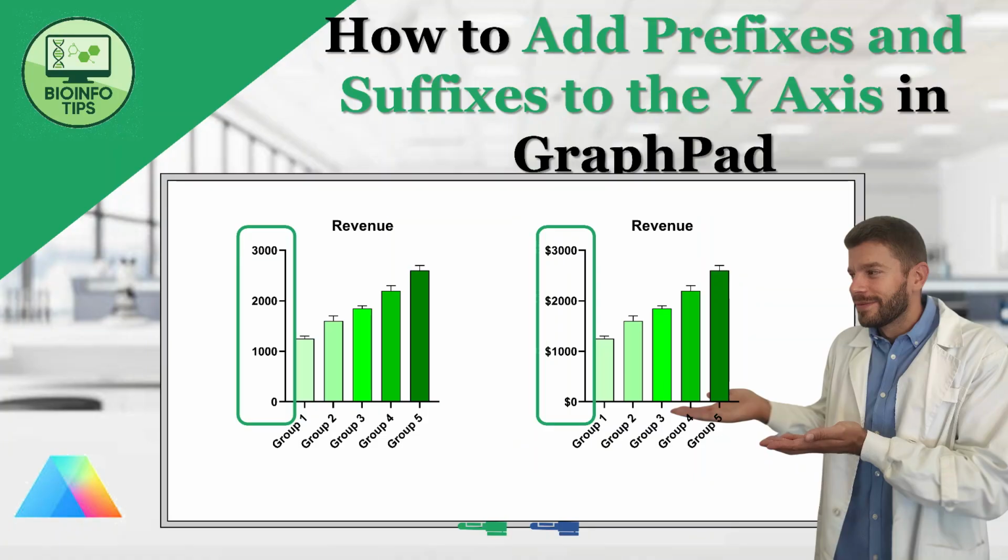You want to know how to add prefixes and suffixes to the y-axis in GraphPad Prism? You came to the right place.